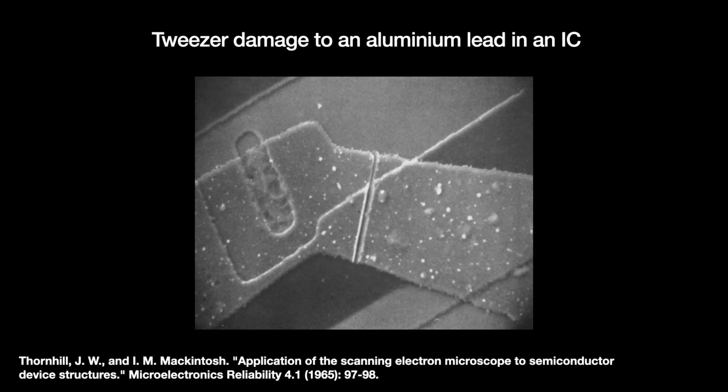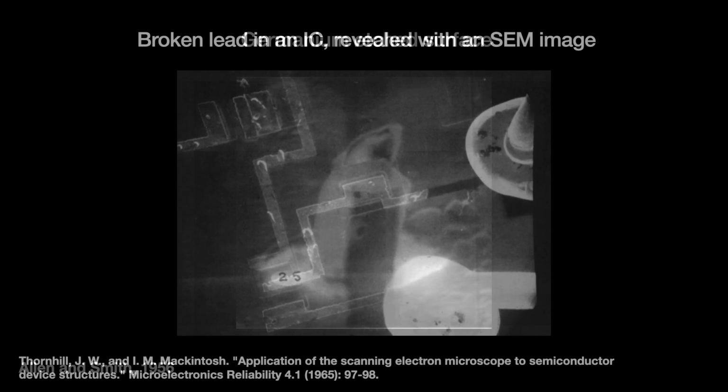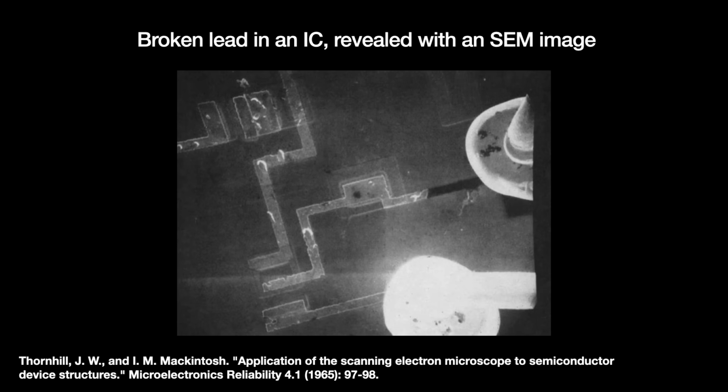This convenience, as well as the microscope's high contrast images, made it easy for technicians to look at malfunctioning chips to see if they might have a broken connection, an invasive particle on it, or some other flaw. As integrated circuits have gotten denser over the years, this has pushed the SEM industry to keep up. This includes the use of digitization and software to improve imagery and shrinking the resolution.